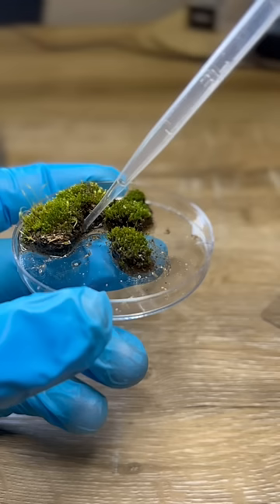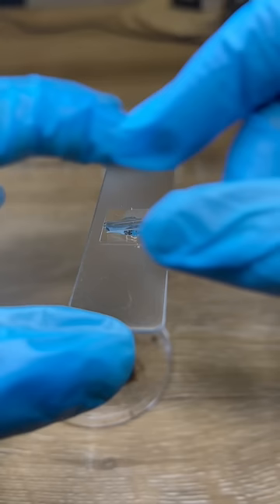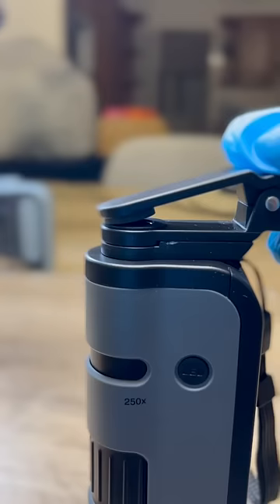But can it really see water bears? Let's test it out. I added some moss water to this slide, then put the slide into the microscope and really put it to the test. I then attached my phone to the microscope using this clip.